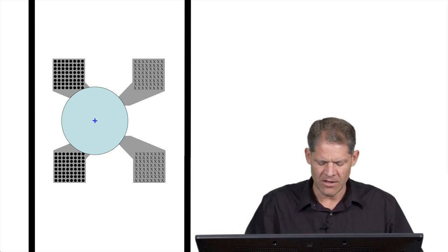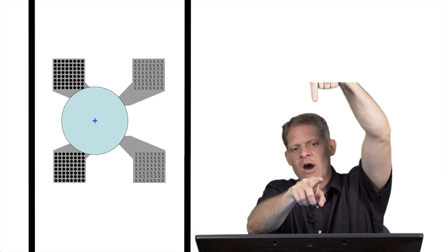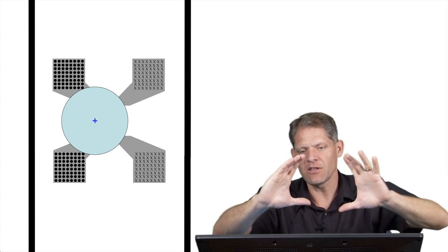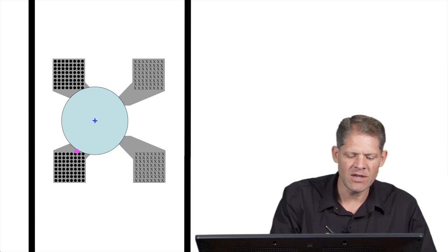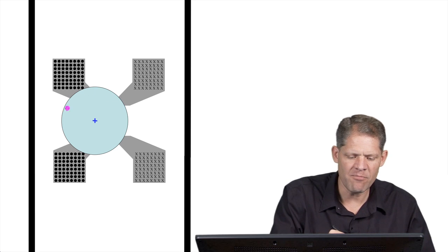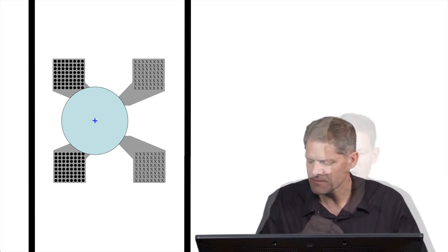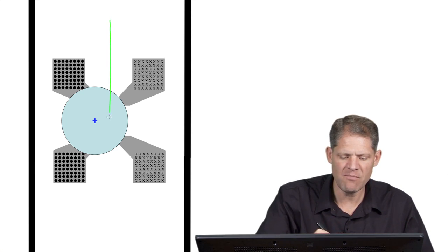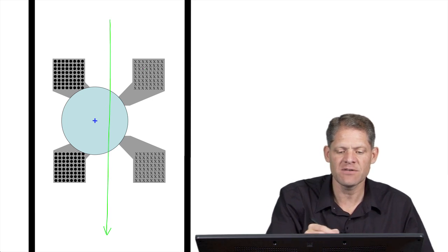And so in fact, the goniometer tube is never exactly coincident with the optical axis of the objective lens. And so imagine that the tube is actually a little off-centered, and that's what I've tried to draw here. Here I've moved the goniometer tube in a terribly gross exaggeration. I've moved it way far away from the optical axis of the objective lens. Now in this case, after aligning the microscope, the beam will be passing straight down here, which is the optical axis of the objective lens.